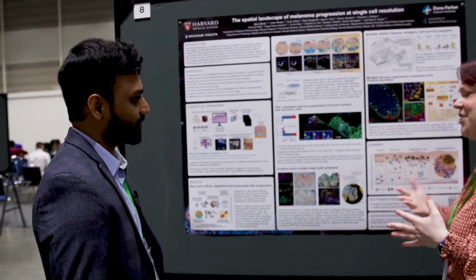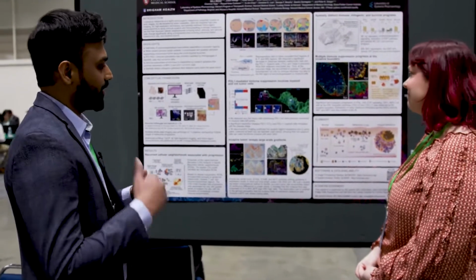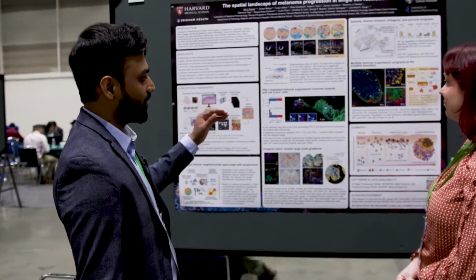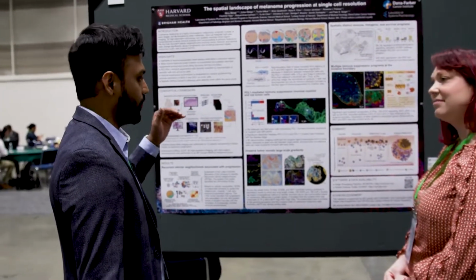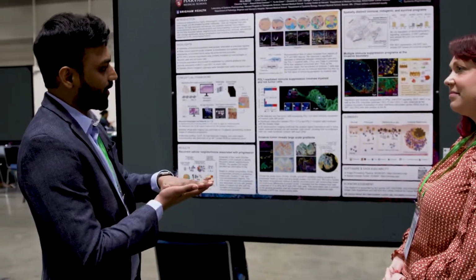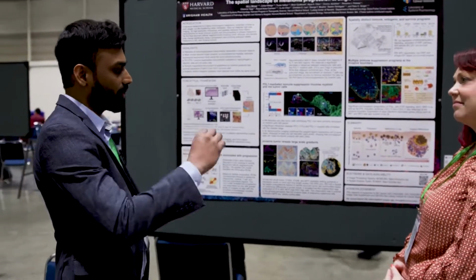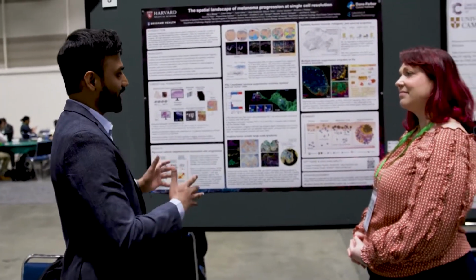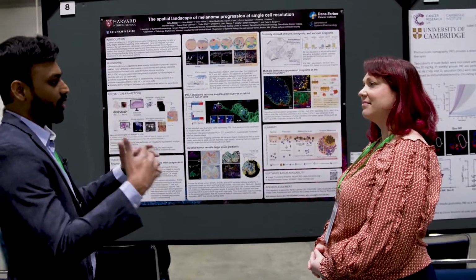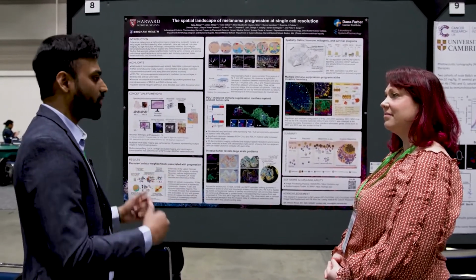What technology do you use for that? So in this case, we have used a DeltaVision microscope, which does optical sectioning and then computational deconvolution to reconstruct into 3D. Again, these are just 5 micron sections. I'll probably get into why we do this, but currently we are trying to increase the thickness to 20 or 30 microns to capture a few more layers of cells. From this initial analysis, we have seen that a cell can have multiple interactions, and it's not necessarily a one-to-one interaction, especially for cells like macrophages within the tumor microenvironment.